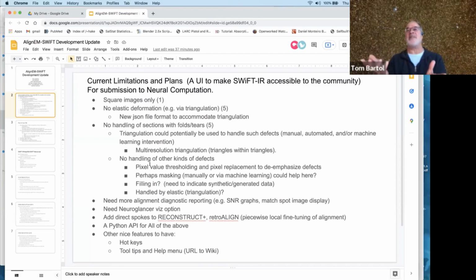SWiM won't have access to TIFFs or JPEGs directly. How do we get those? So my original thought was, oh, this is going to be clunky, but we can do it. We can just get them and export them out into a separate, temporary directory, give them to SWiM, and then get the affine transform and apply it to those.